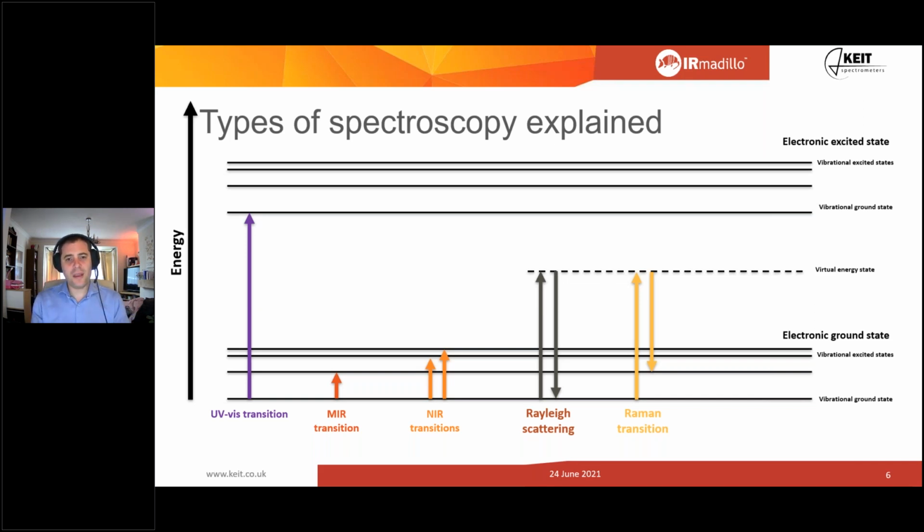Basically, every molecule has energy levels. Molecules have energy, and we know this. When you heat things up, they get hot, they take energy in, then they emit that energy and they cool down. That's predominantly infrared, but infrared light is only a small part of the wavelengths and the spectrum of light. So infrared happens to sit just outside of what humans can see.